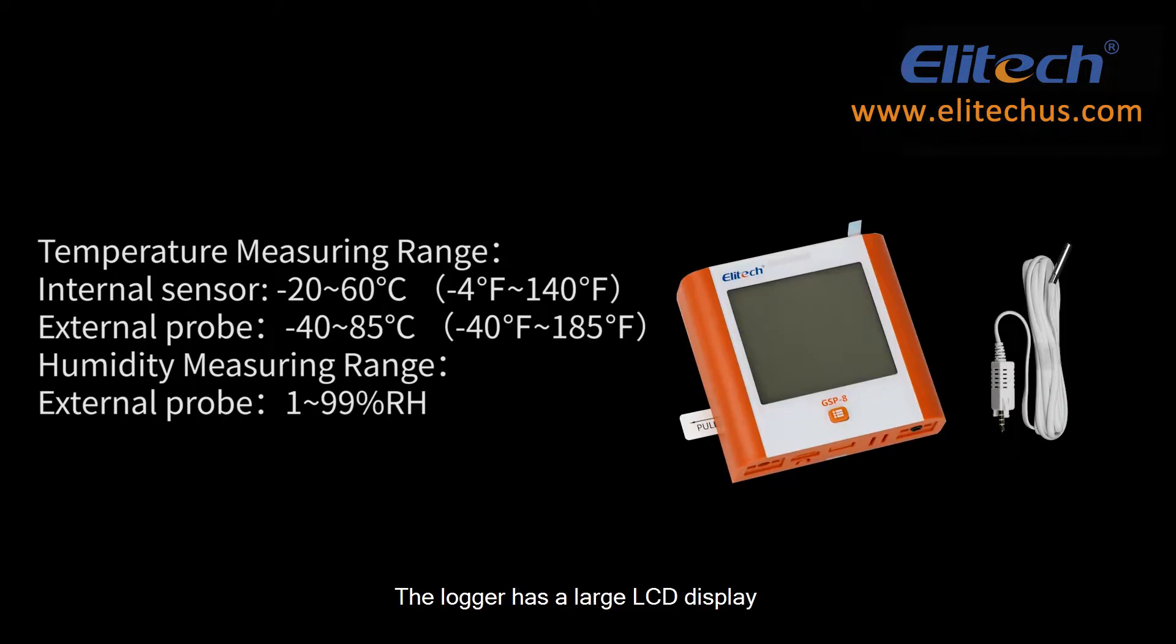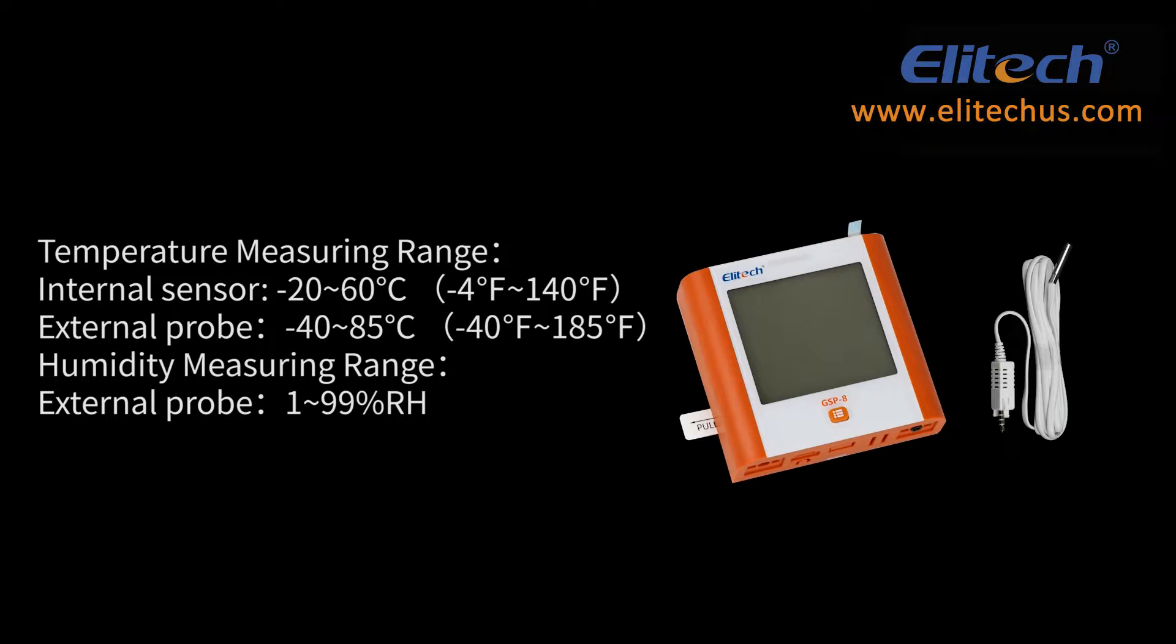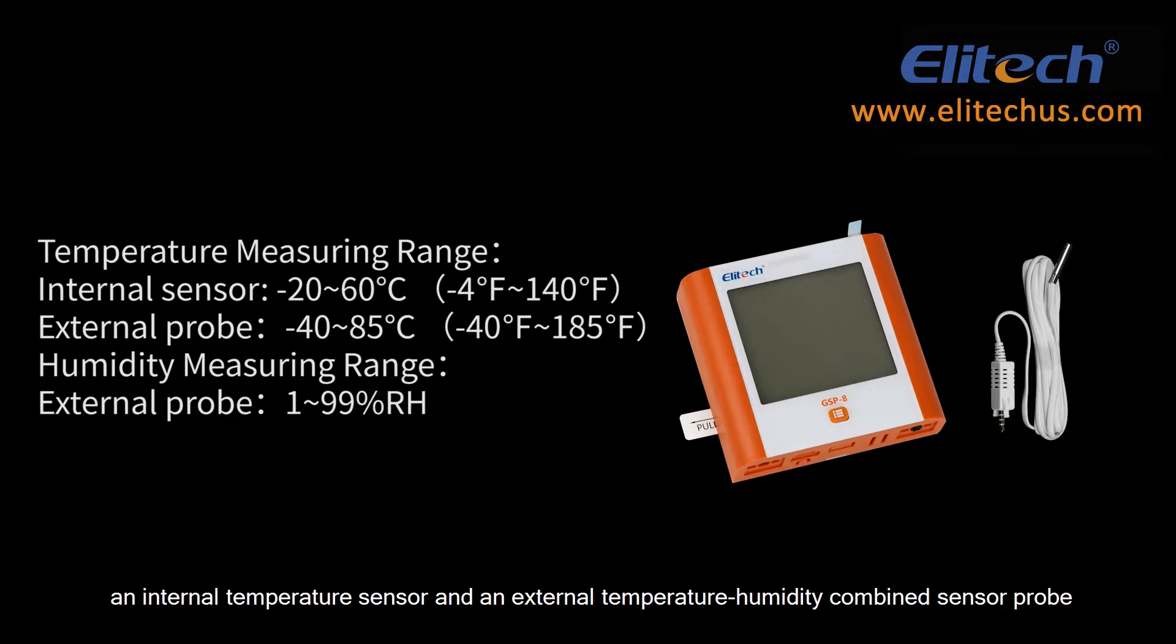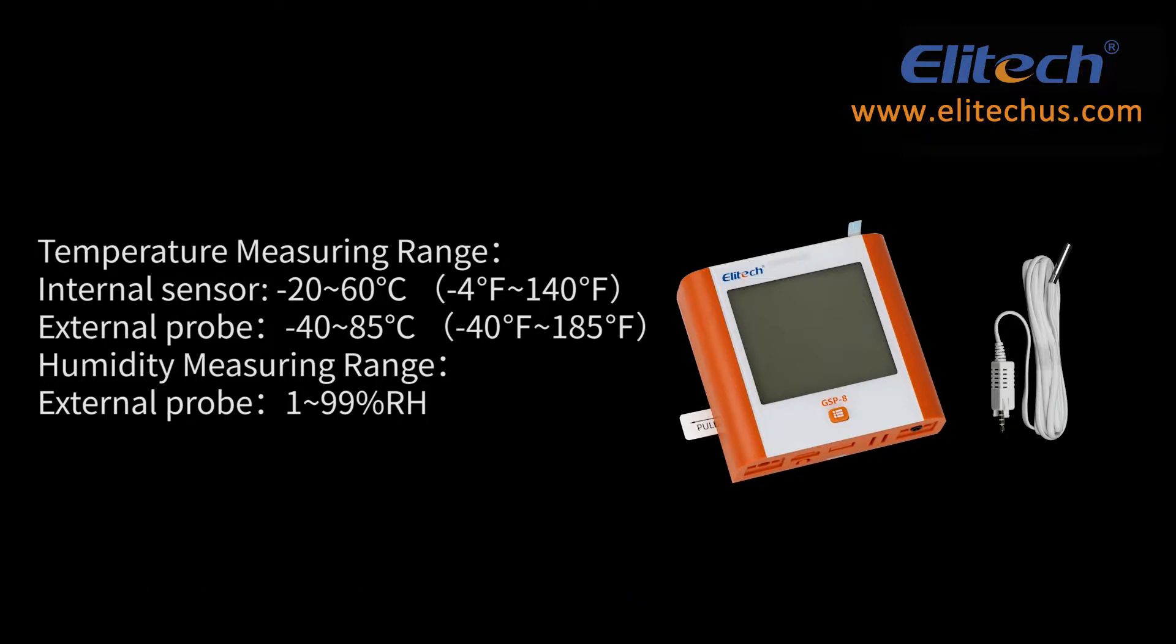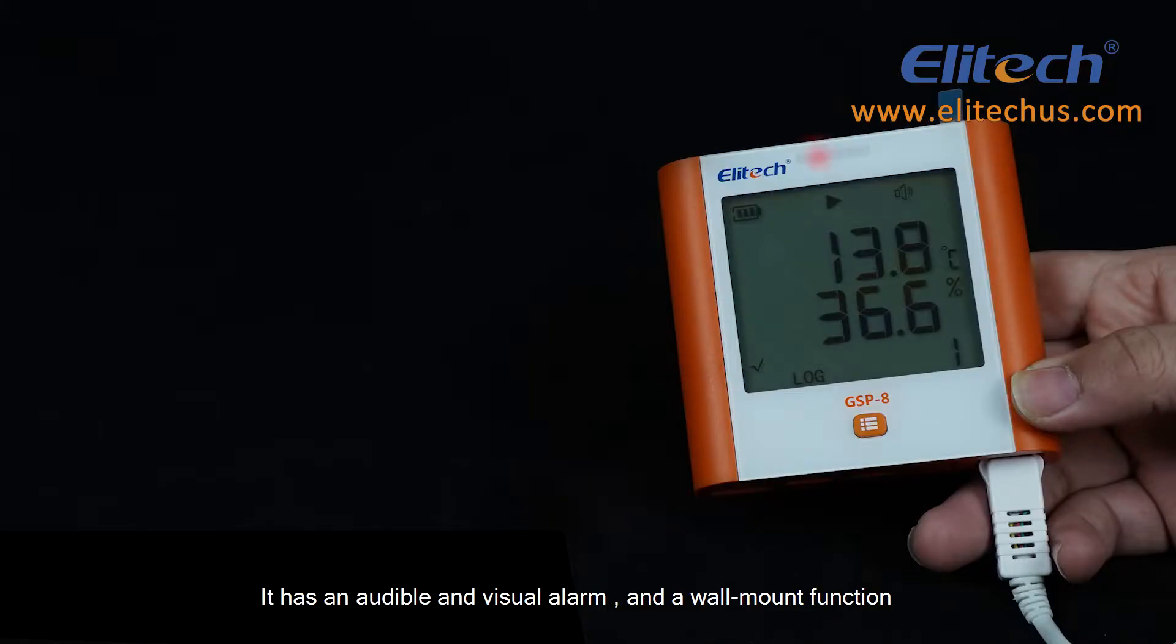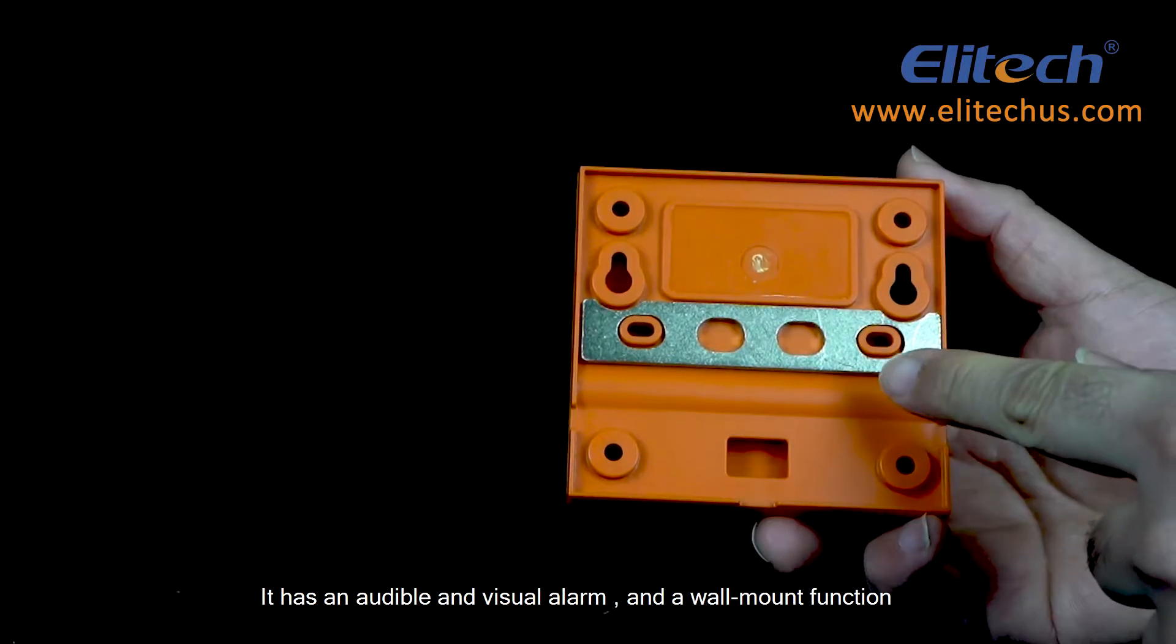The logger has a large LCD display, one press button for operation, an internal temperature sensor and an external temperature-humidity combined sensor probe. It has an audible and visual alarm and a wall mount function.